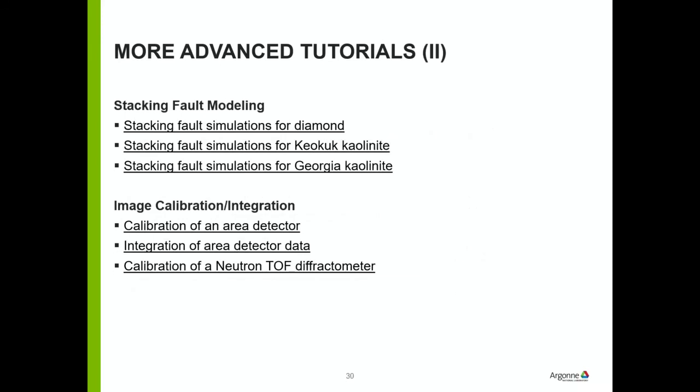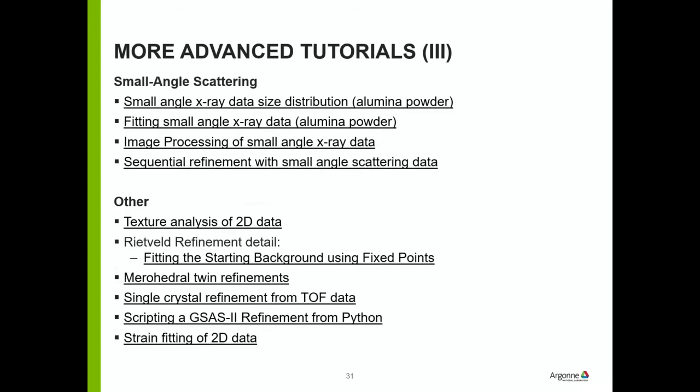There's some modeling for stacking faults. There is the business about how you do image integration and calibration. And there's also some examples for small angle scattering and other ones. There's also a bunch of examples for doing magnetic structure analysis.